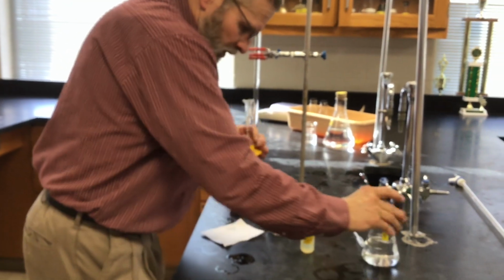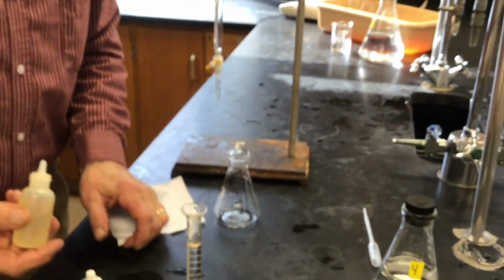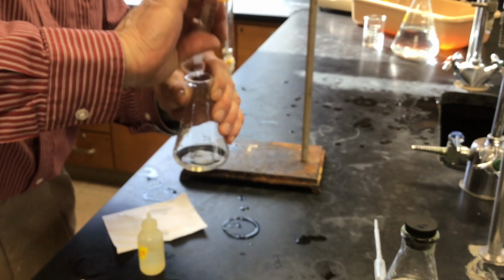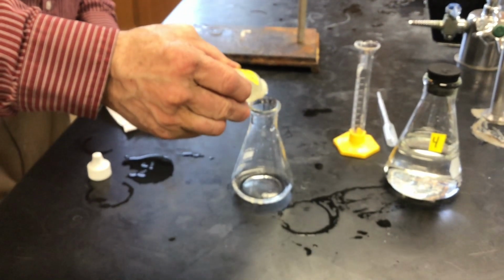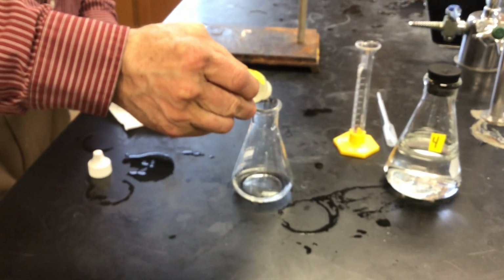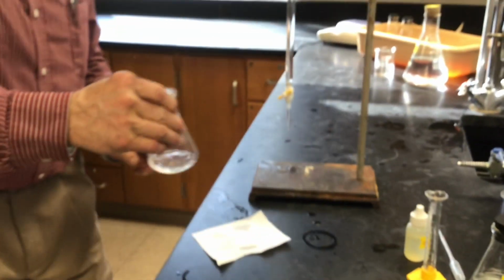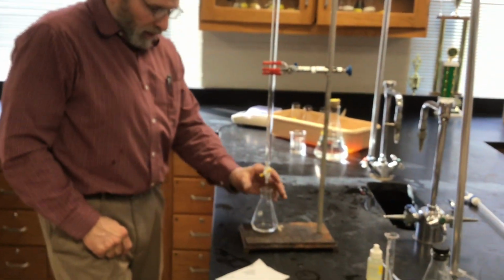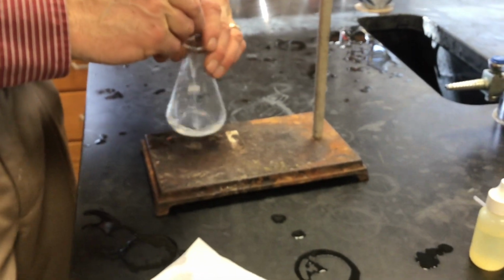Okay, so there's 10.0 milliliters. Oh, hold on, put that in the flask. That's what happens when you do this 20 times. Okay, let's try this again. 6 drops. 1, 2, 3, 4, 5, 6. And of course, the final burette reading for trial 1 becomes initial for trial 2.